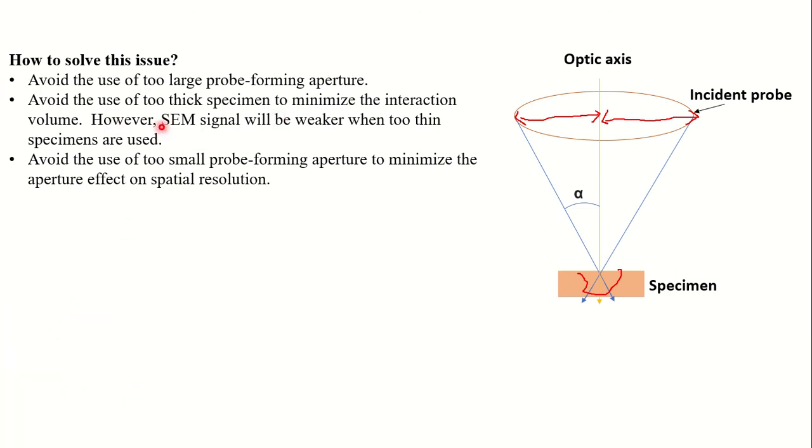Avoid the use of too thick a specimen to minimize the interaction volume. So the sample thickness must be smaller to minimize the interaction volume.